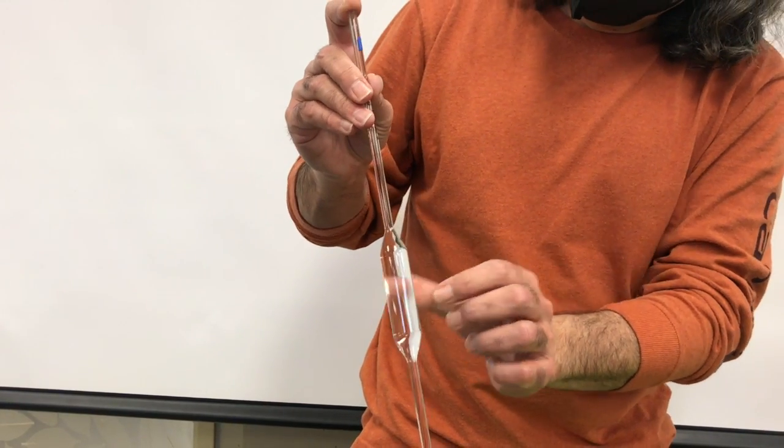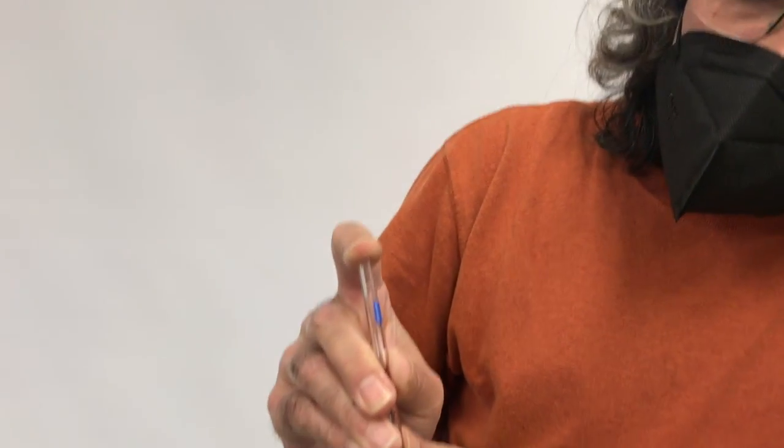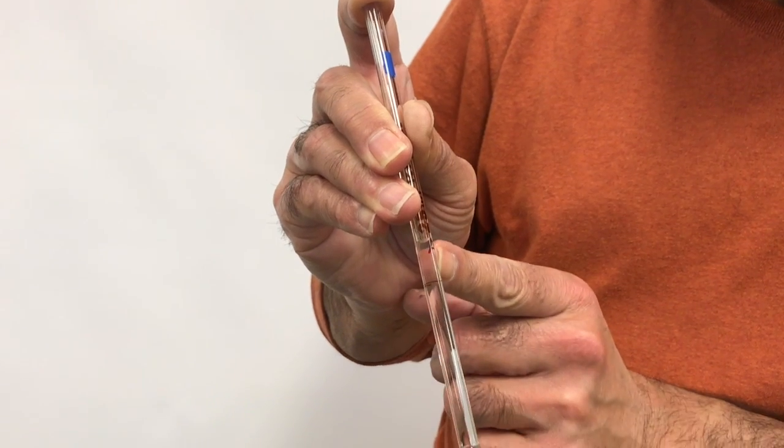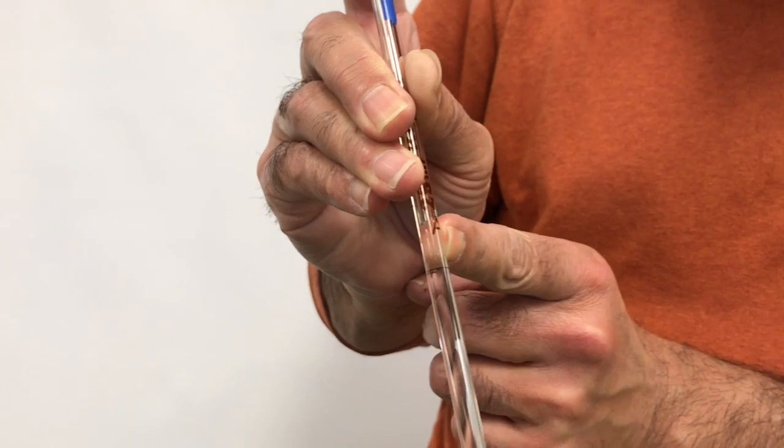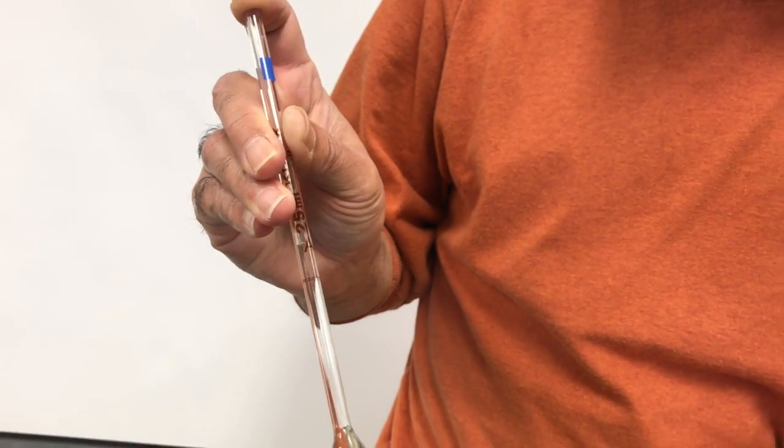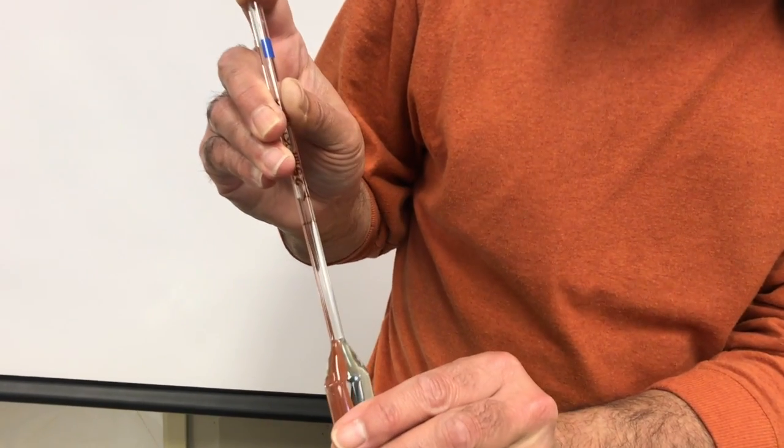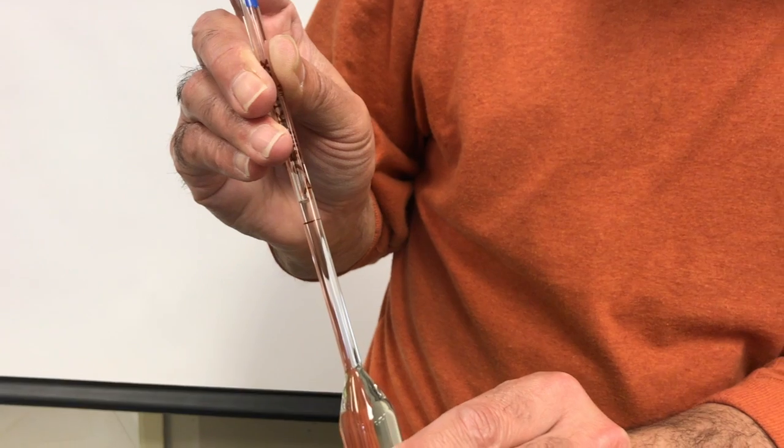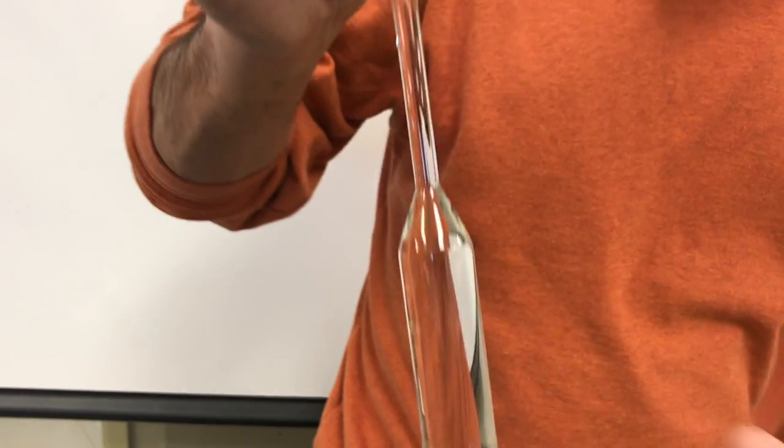So all volumetric pipettes are marked to a set volume. This is a 25 ml and to get exactly 25 ml, you need to bring the meniscus right on top of the 25 ml mark on the volumetric pipette. Again, I went past the mark intentionally and I'm just slowly going to release some of the vacuum until I get the meniscus to go right on the line.